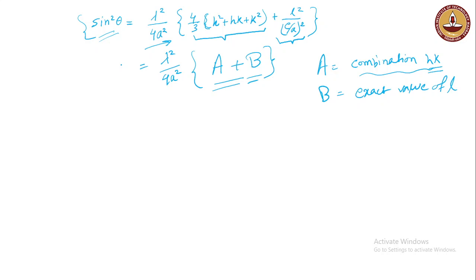This is our job we have to do. Now we have to find the value of A and value of B.